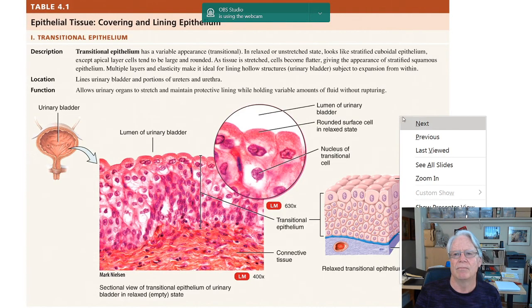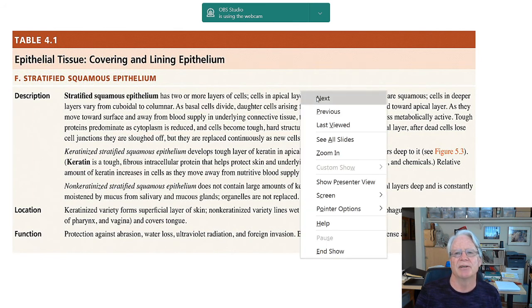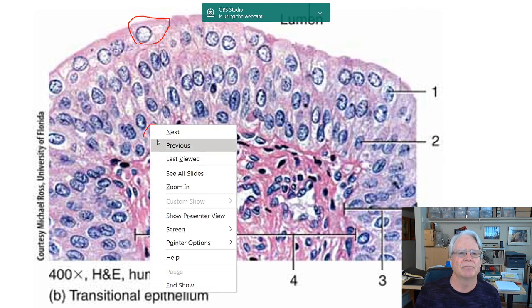Okay. All right, so why did they do this? I did not see this. Pretend like that's not there. Let's move on. All right, so here we go. There. And smaller down here. Gosh.